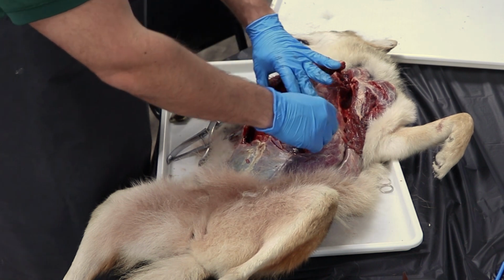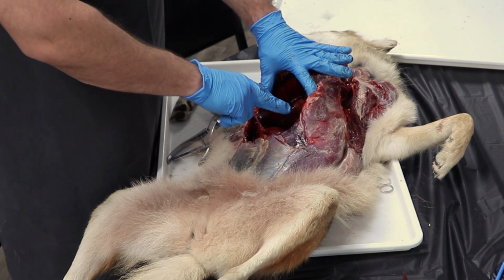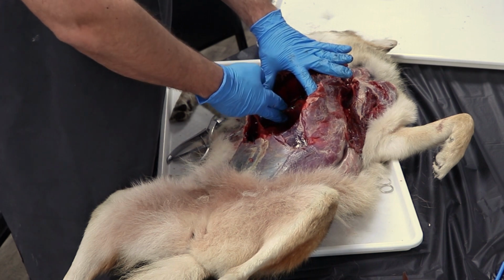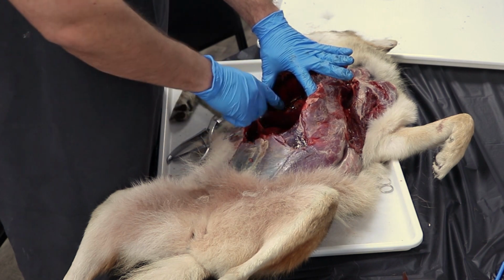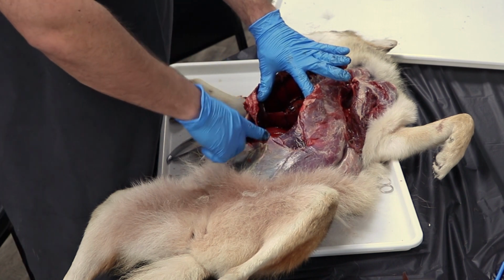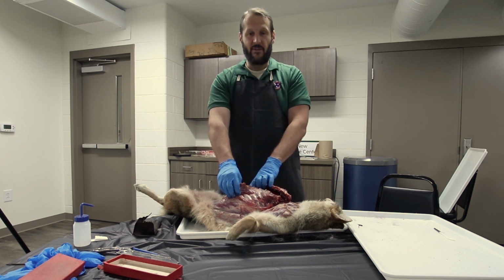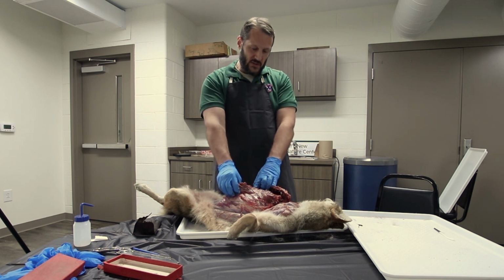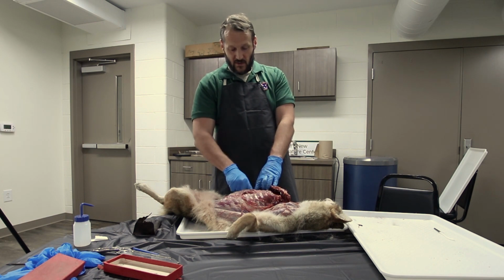So one of those structures, the diaphragm, serves to separate the abdominal cavity from the thoracic cavity. But what it also does is provides the fleshy and muscular base for lungs to inhale and exhale. So like I said, this is something you'll find in a mammal like this coyote or a bird, but you don't find it in most reptiles. Interestingly enough, there is a reptile that you can find a fleshy diaphragm in, and it's the crocodilians. Alligators and crocodiles actually have an awful lot in common with birds and mammals, and possessing this diaphragm is one of them.